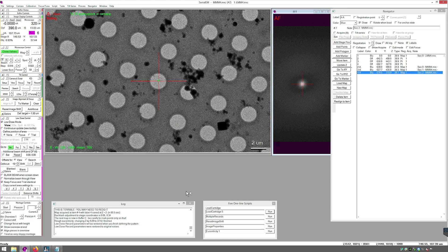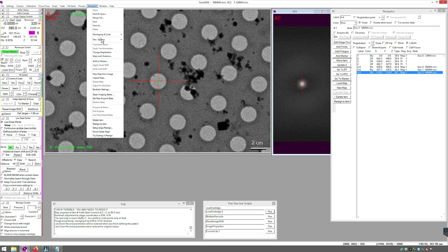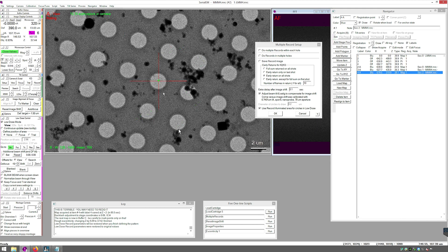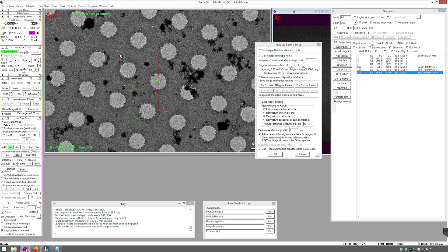Now open the Multishot Parameters dialog box: Navigator, Montaging and Grids, Set Multishot Parameters. With that open, we are going to do records in multiple holes — check that box. The pattern for the last grid will appear. You now need to define the new pattern. Place four points, one in each corner of the three-by-three shot pattern, using the Add Points button.